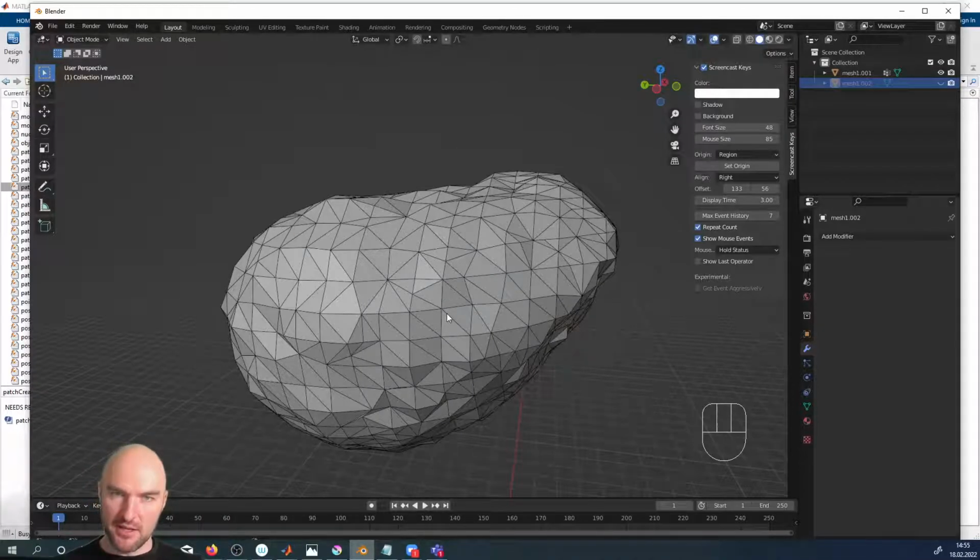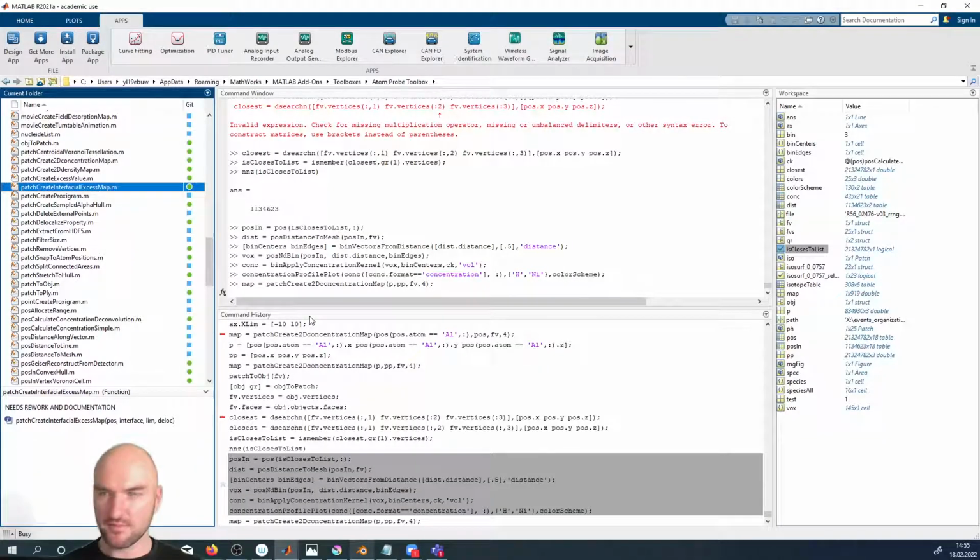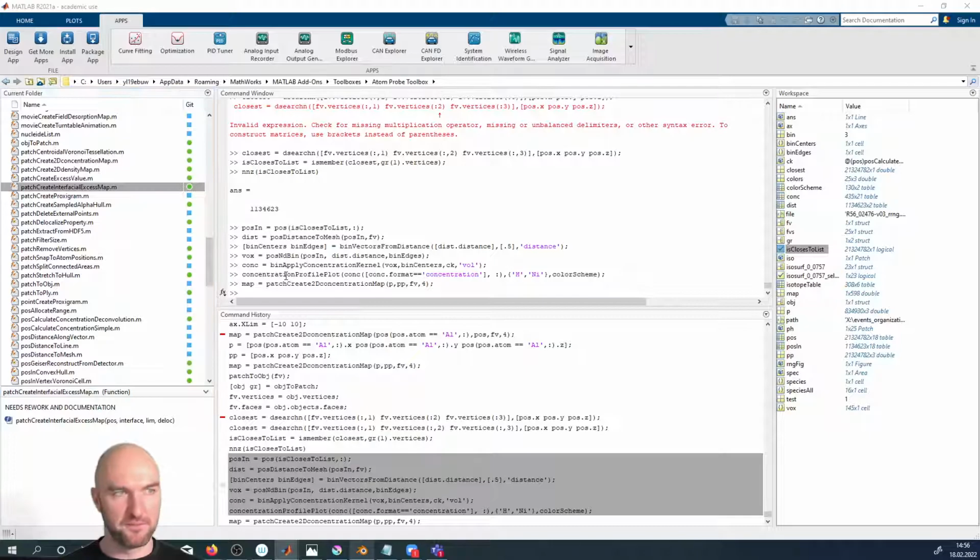You can just mark your vertex groups and then copy the vertices into a PLY file or into the clipboard of the computer, so that it becomes very easy to export vertices and meshes from Blender, including vertex groups, without having the poly group issue.